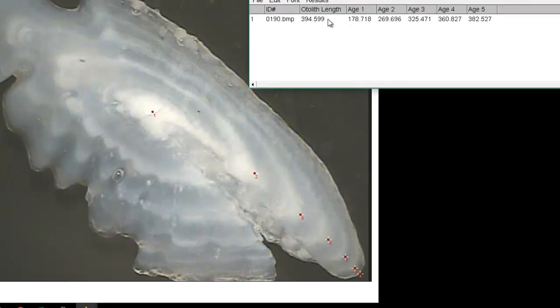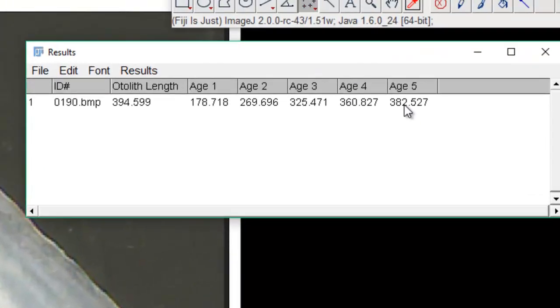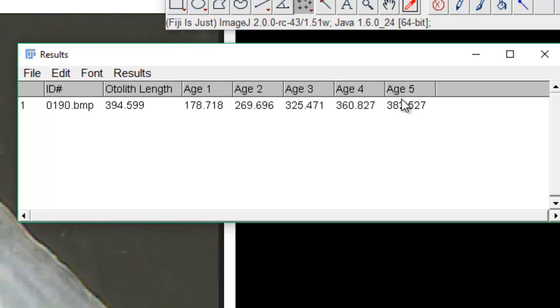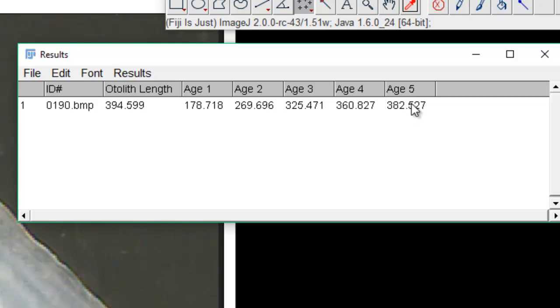If we just kept the measurements in order, the last value would always be the otolith length. But fish have different ages — you'll have some H1, some H6, whatever. That would make it very difficult to work with in Excel because you'd always have the last value be the otolith length, not an annulus. This way, your otolith length is always in the first column, no matter what age the fish is, making your life a lot easier.